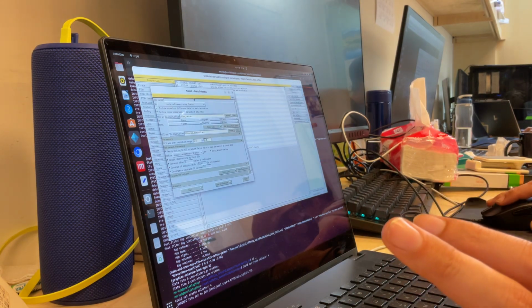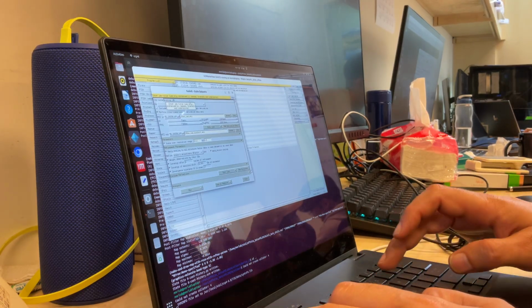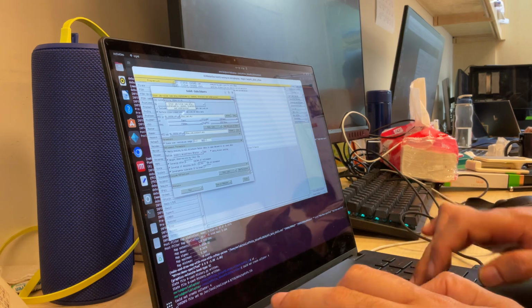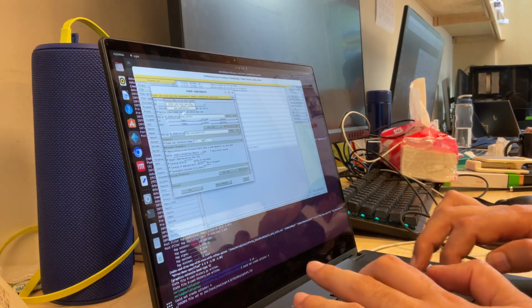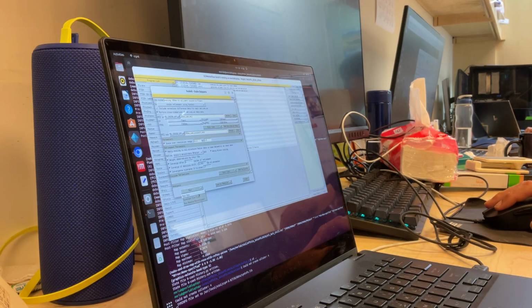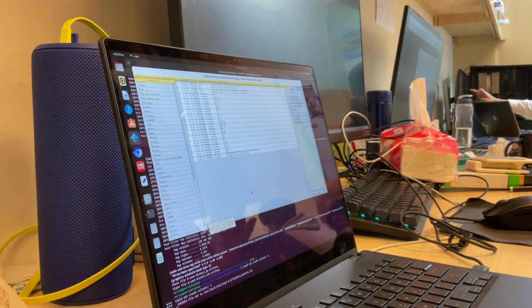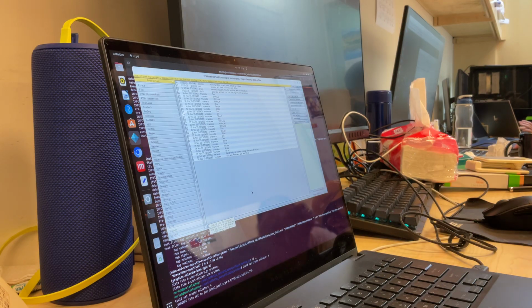So now let me write it here. Scaling 180 picoseconds to all dark, scaled to FC dark. Okay, and so now we run it, and that's it, done. Okay, so now we have the data. Now the next step, with this you could extrapolate. You can talk to them. They might have a better script for extrapolating, but you just talk to them. They will give you the scripts and whatnot for that.